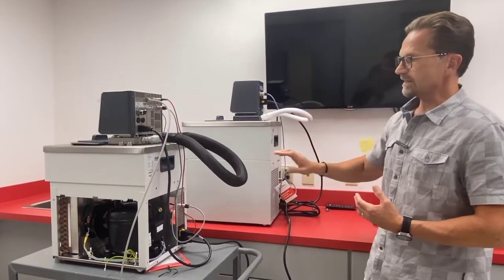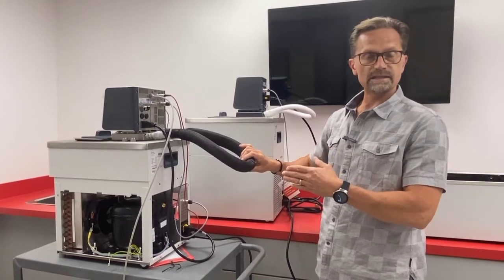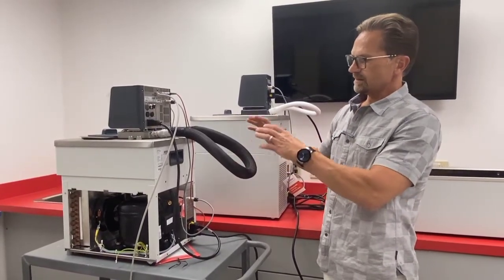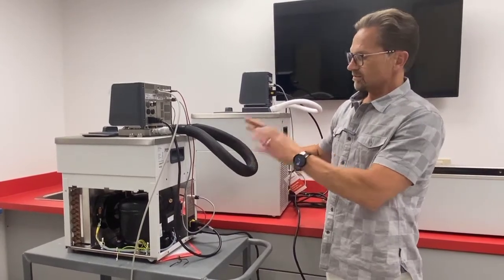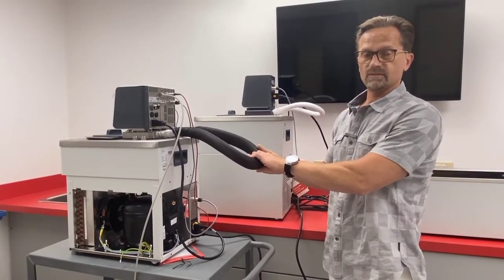Contrast that to this tubing, which is our triple insulated tubing, rated down to minus 90 degrees C and up to 300 degrees C. There's no condensation whatsoever. This is maximizing the cooling power or heating power of your circulator, minimizing any loss to atmosphere, so you get optimal performance from an insulation perspective with this type of tubing.